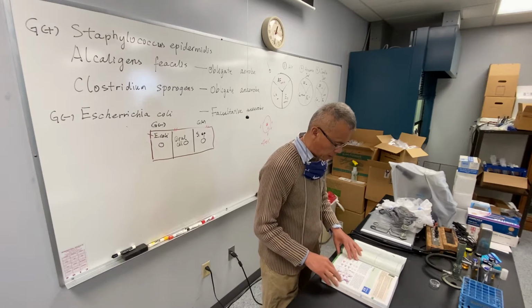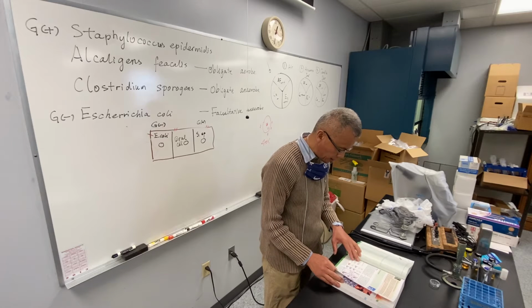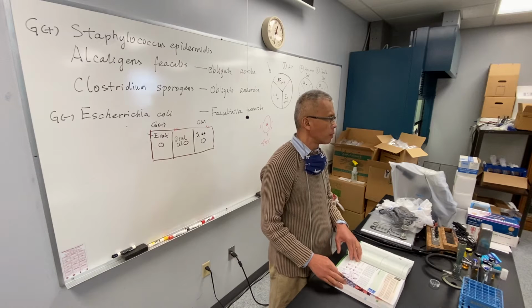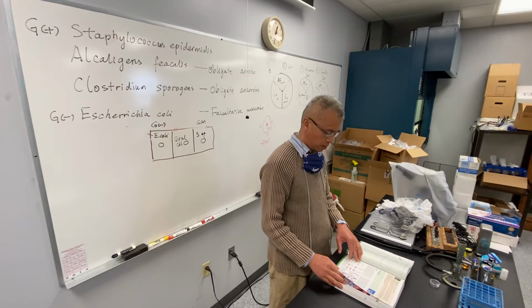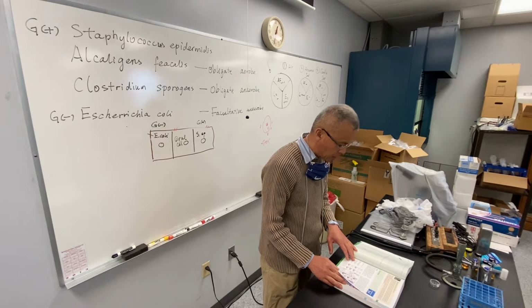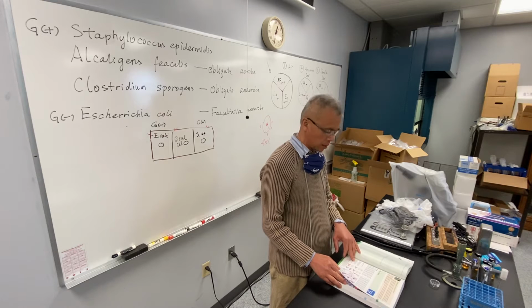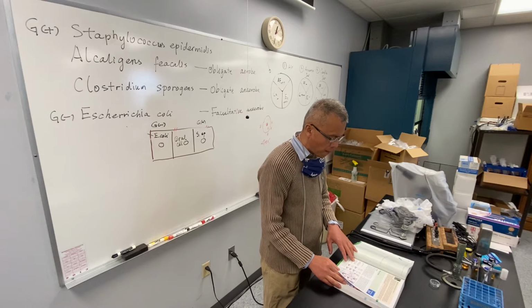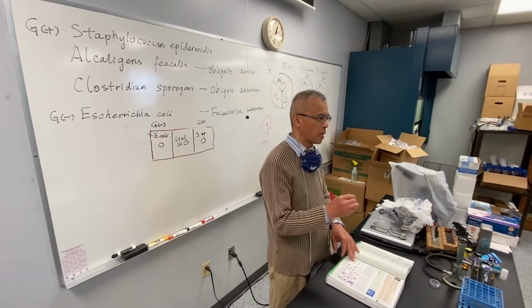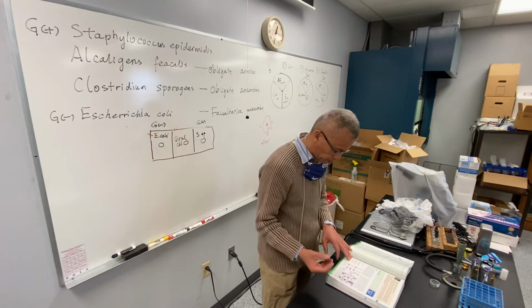And about the stain itself, with two dyes, one is called crystal violet, which stains both types of cells purple. This is like a simple stain. So the first step is the simple stain, and the second step is decolorization. Use 90% alcohol to decolorize, and only the Gram-positive cells can retain the dye, and the Gram-negative cells will eventually be decolorized and have no color.